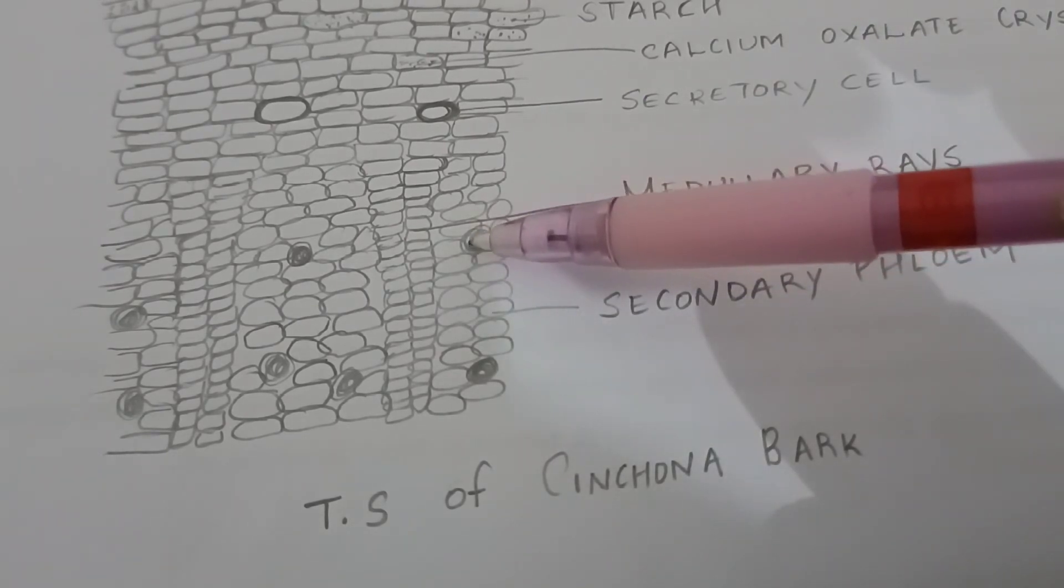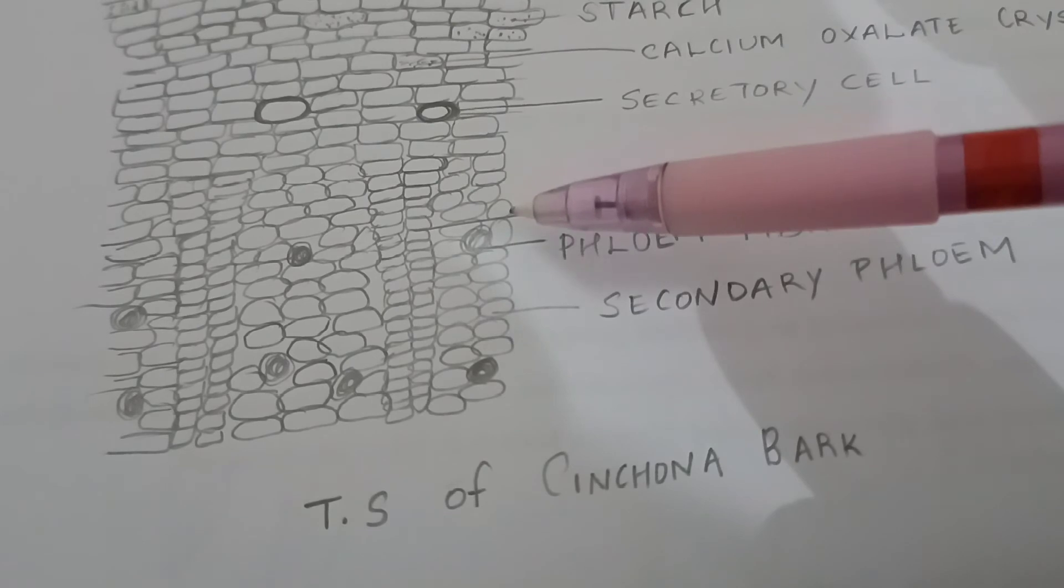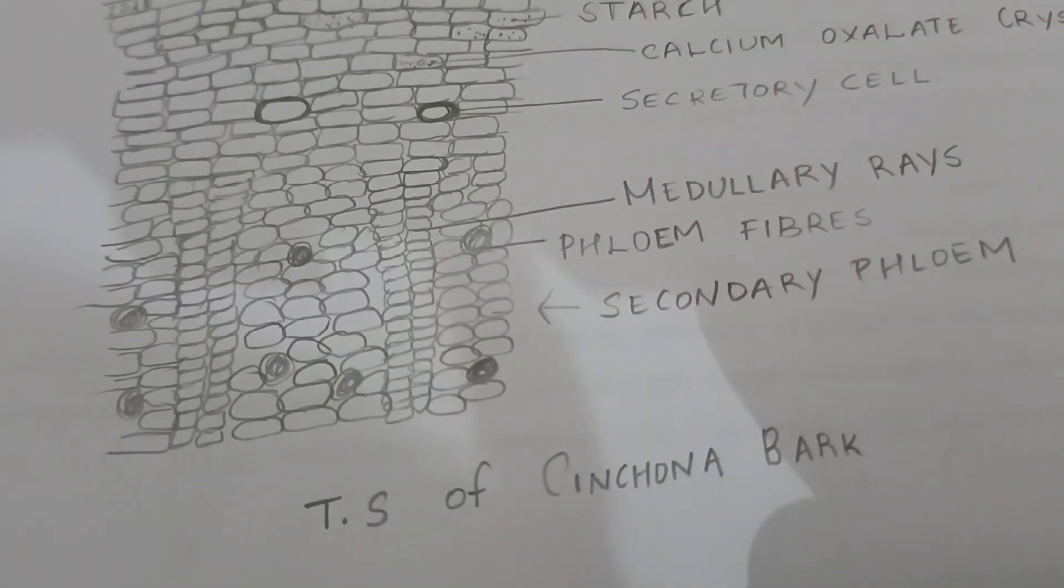Phloem fibers, characteristic of cinchona bark, occur intermingled with phloem parenchyma and in between medullary rays. Fibers are numerous, mostly isolated at times in groups of 2-3, rounded to oval in various sizes, yellow in color, thick-walled, strongly lignified with small lumen and stratifications.